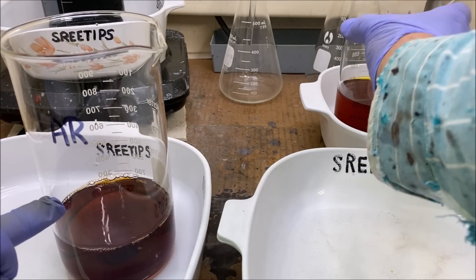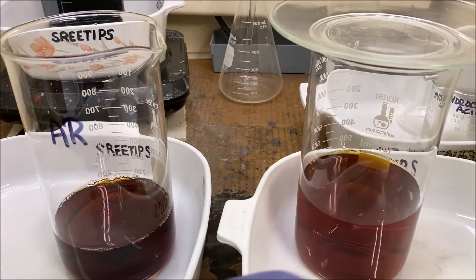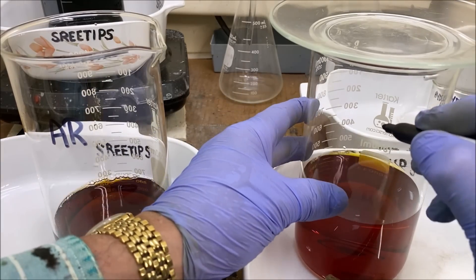I'm going to pull this funnel off and add this palladium solution that's been dissolved in aqua regia into this container — it's palladium and platinum in here I believe. I've got this beaker marked AR for aqua regia, and we're going to put AG on this one.